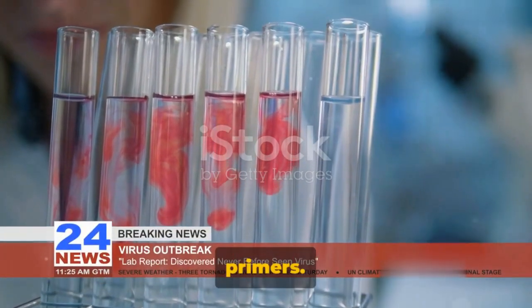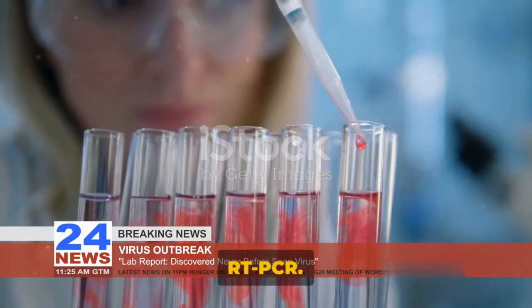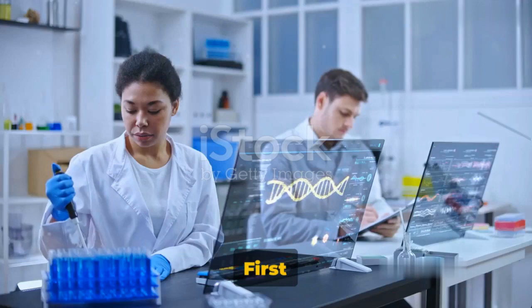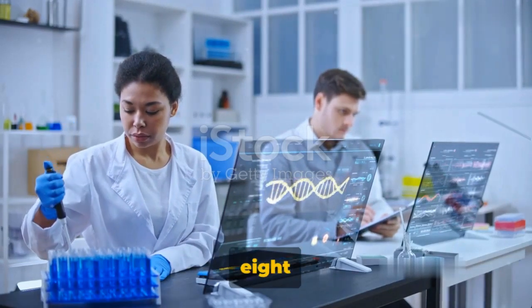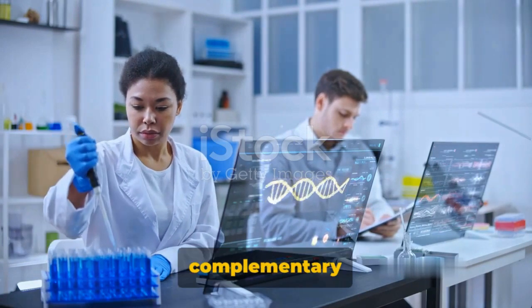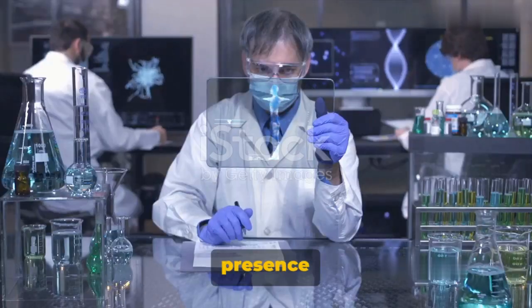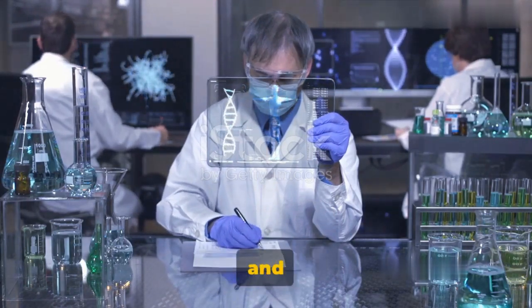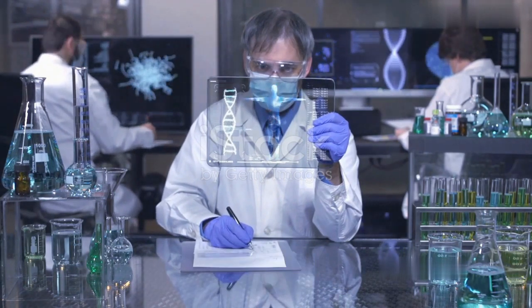Now, on to the primers. These are the signals that guide the enzymes in RT-PCR. There are 3 different types, each with a specific role. First up, we have random primers. These are short sequences of 6 to 8 nucleotides that bind at any complementary site on the RNA. They don't discriminate based on the presence or absence of a poly-A tail. Instead, their function is to synthesize cDNA using reverse transcriptase.